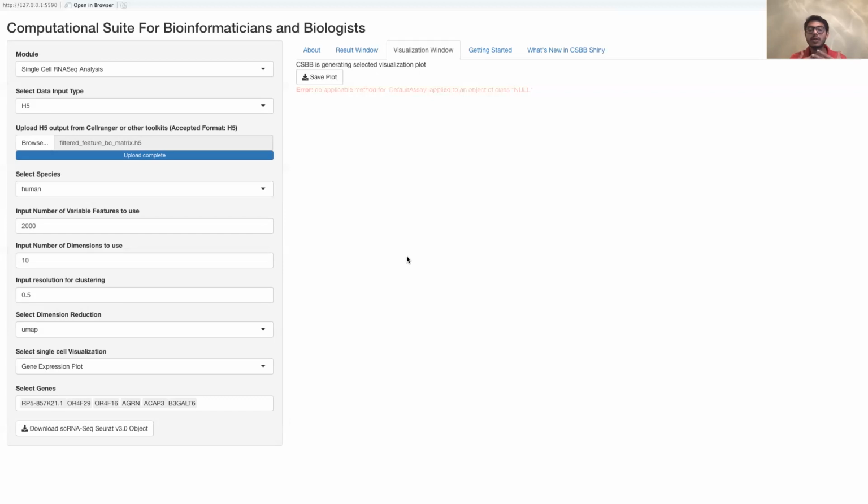With time, the plan is to add more analysis toolkits. Seurat is one, but there are others like SCRAN, and Spring, and so on, which could be easily integrated into this framework, where people will have more flexibility of using the toolkit they want, rather than just using Seurat here.